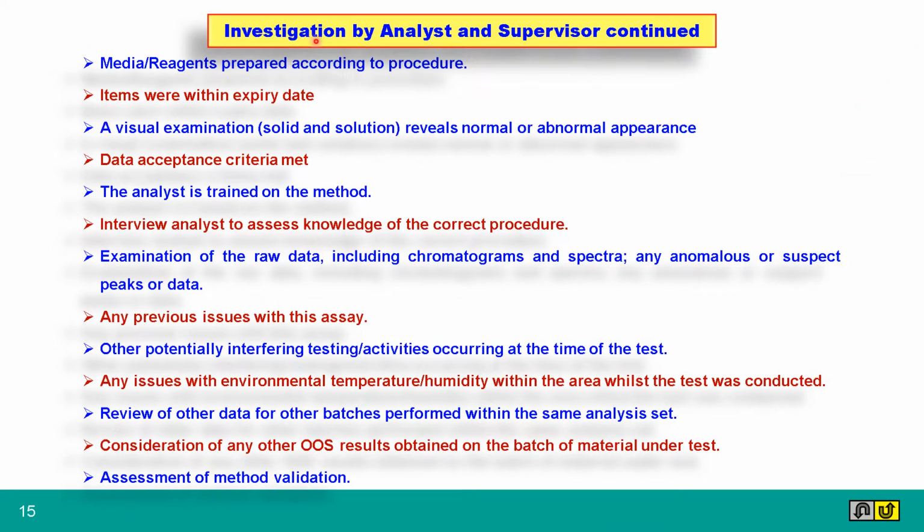Investigation by analyst and supervisor continued. Media / reagents prepared according to procedure. Items were within expiry date. A visual examination, solid and solution, reveals normal or abnormal appearance. Data acceptance criteria met. The analyst is trained on the method. Interview analyst to assess knowledge of the correct procedure.